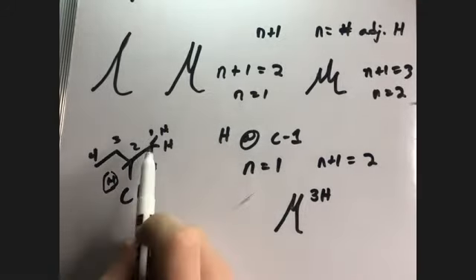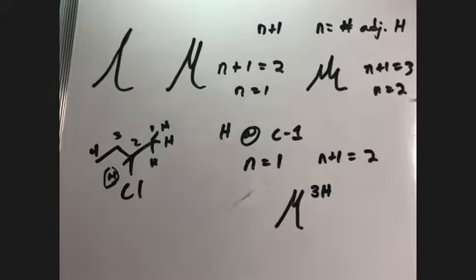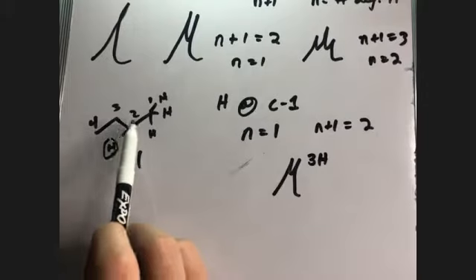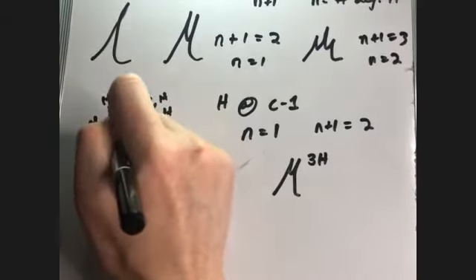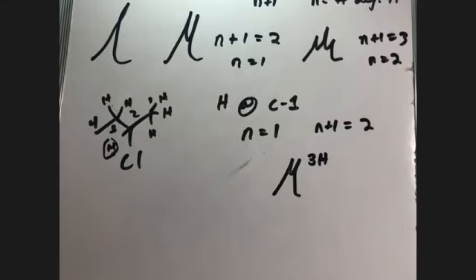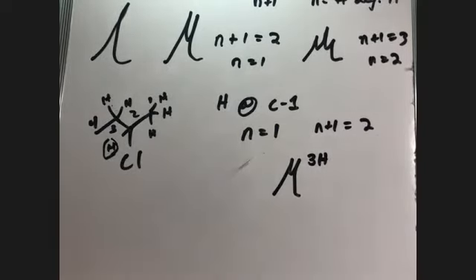It tells us that we're looking at this carbon. And I'm not showing the chemical shifts here just to simplify, but we'll tie that all together once I go through each one. So then at carbon 2, this now has multiple neighboring carbons, right? Carbon 1 and carbon 3 are both directly adjacent to carbon number 2. So there is this additive effect for splitting. The total number of neighbors at carbon number 2 is 5, 3 of them coming from carbon 1, 2 of them coming from carbon 3, hence the total of 5 that I gave, right?